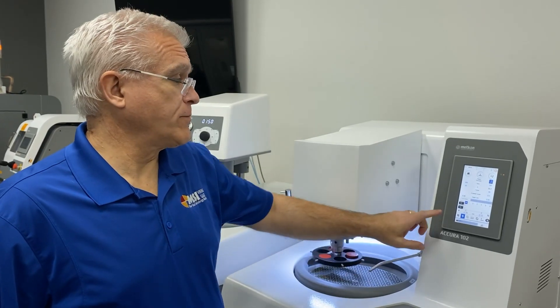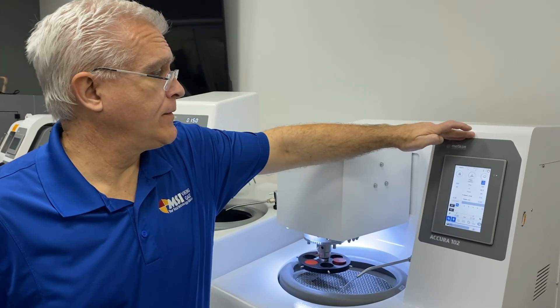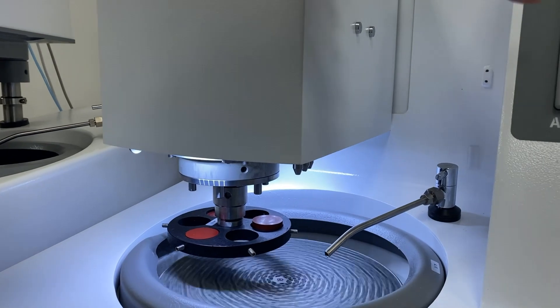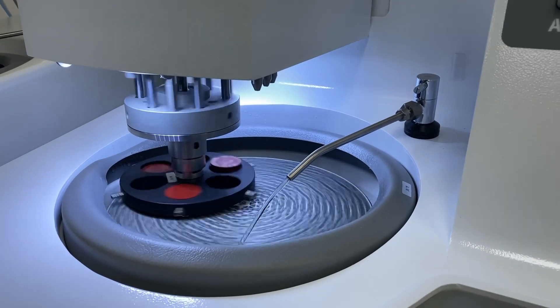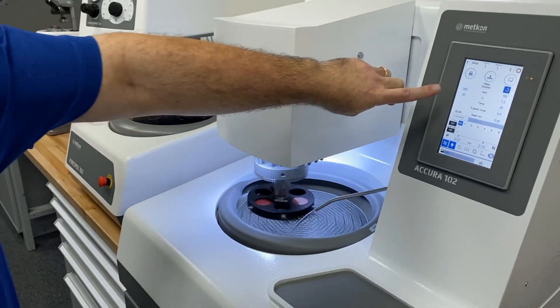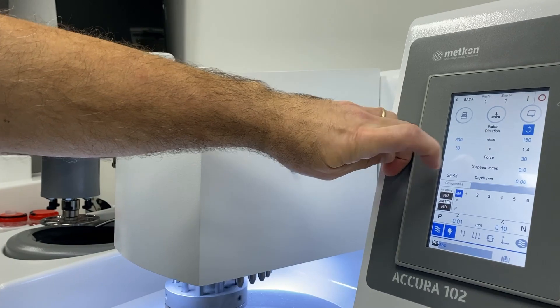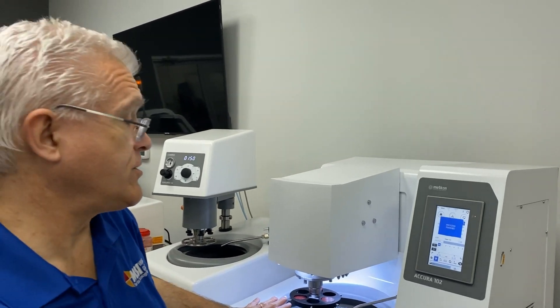Now it's time to start the polishing process. I'll activate the water and initiate the program. You see that the display is counting down the program to its completion. It has a soft start and a soft finish, so you don't have skid marks on your samples.